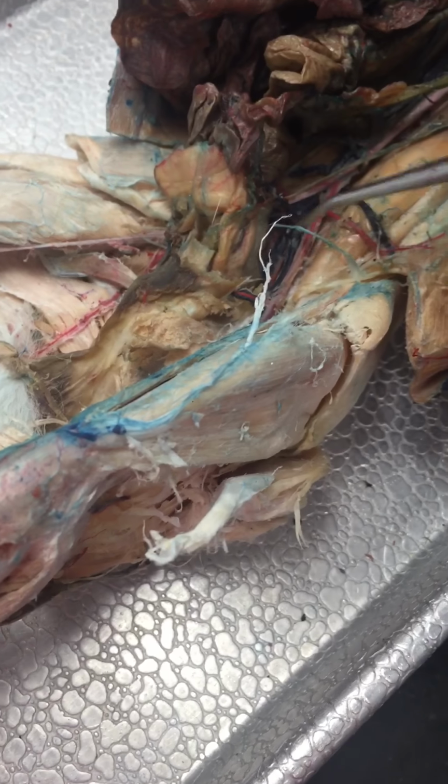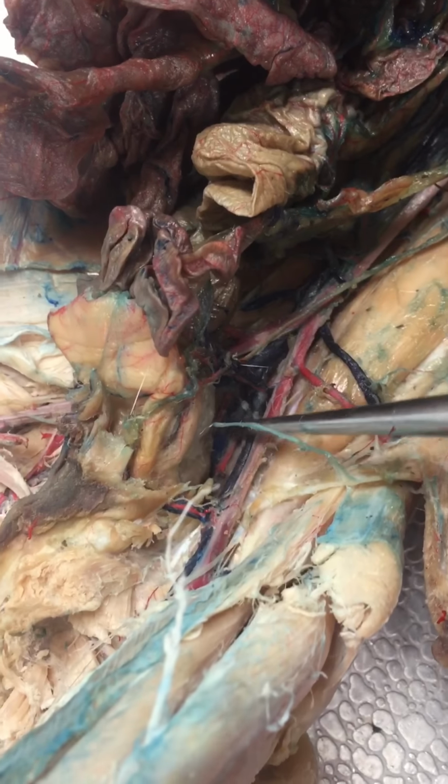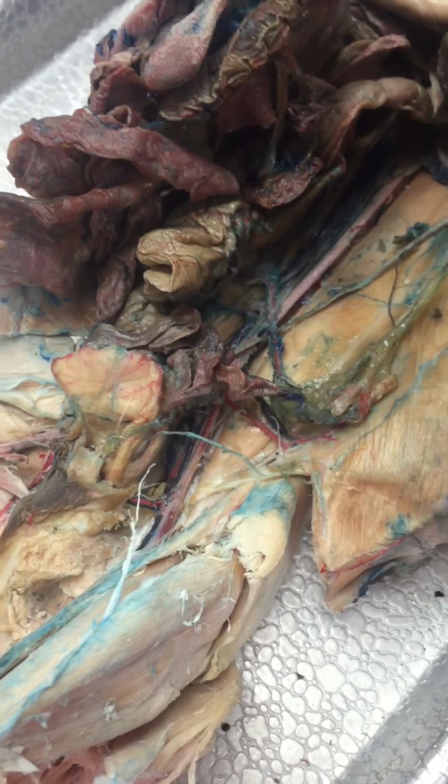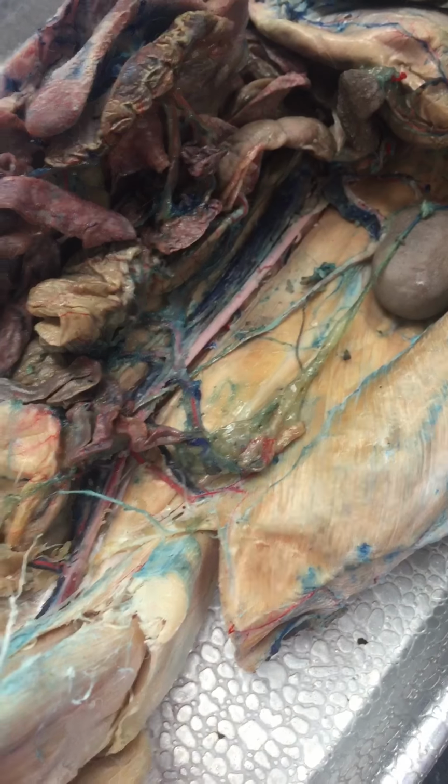Then all the way in here, this one is our medial sacral. Right in there, this big blue one. And, oh, I forgot. This one is our ovaries, so these are our gonadal veins and arteries. I think that's it.